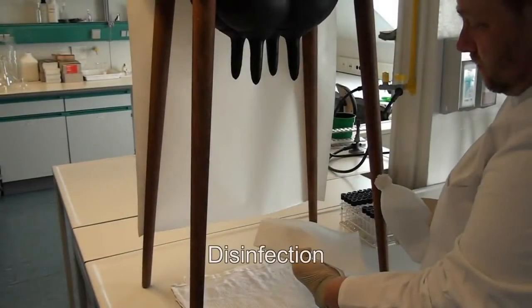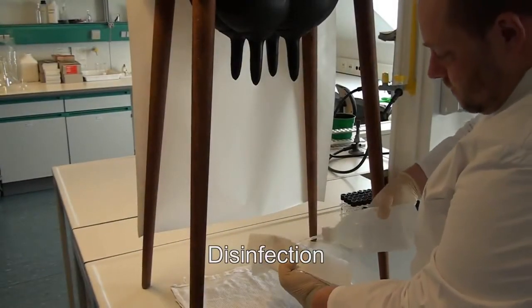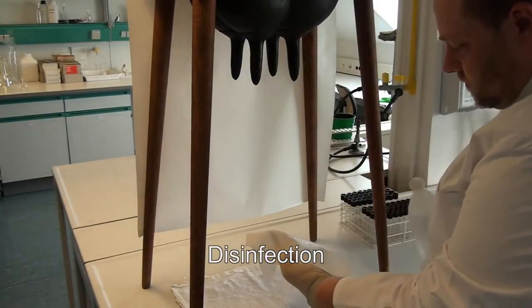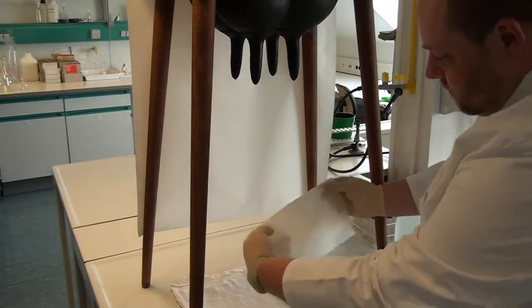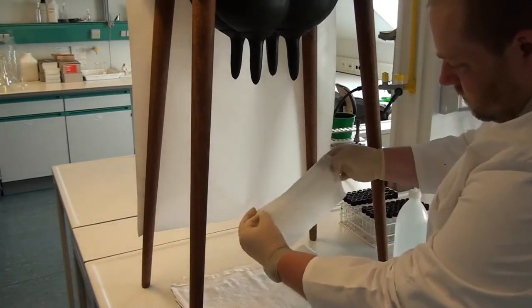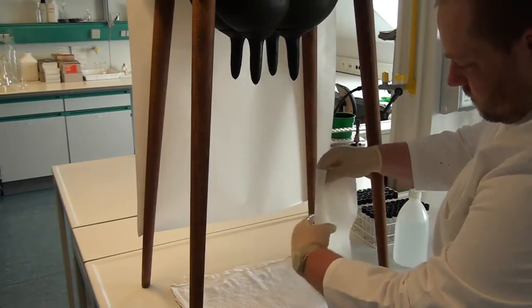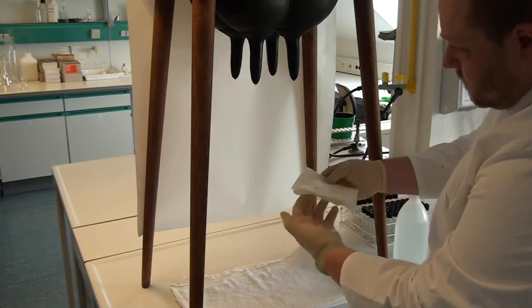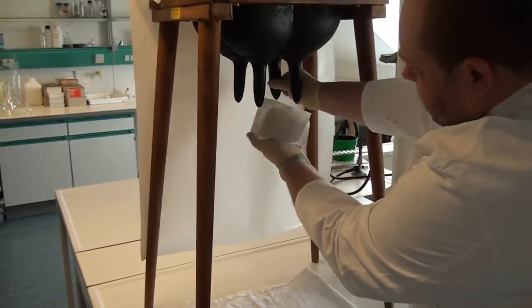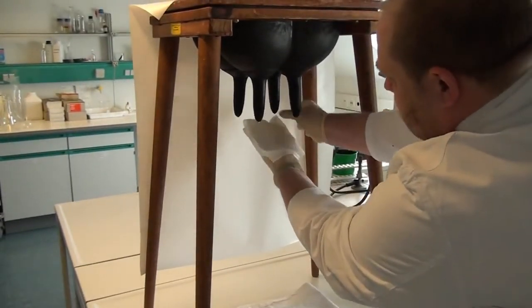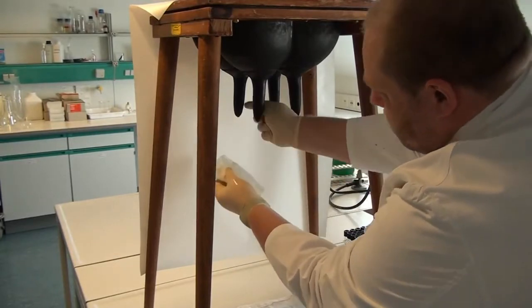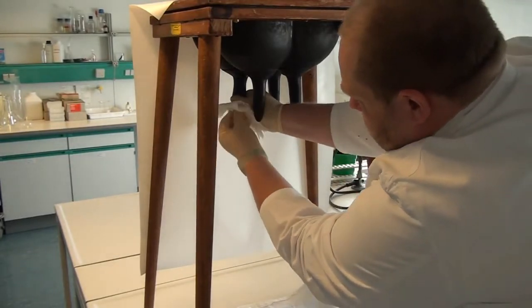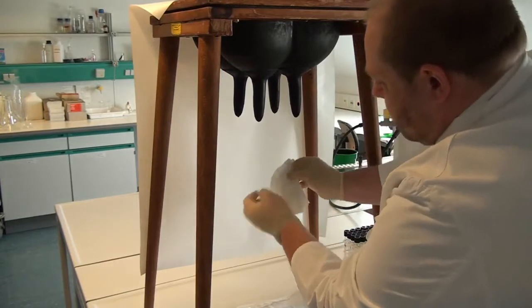By now, teats should be ready for milking, meaning that they appear plump and are thin-walled. To disinfect them, either single paper towels are used for each teat, or towels are folded in a simple way as seen here. In any case, towels must be soaked with alcohol. It is important for the operator to start disinfection with the opposing quarters in order to avoid contamination with his or her hands.